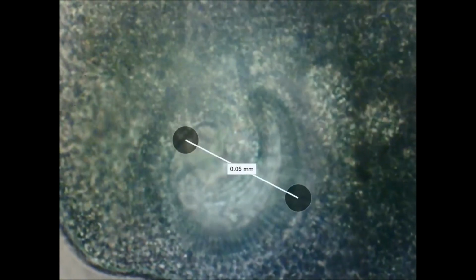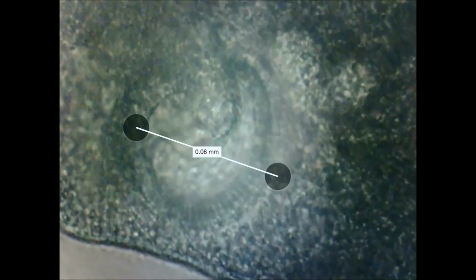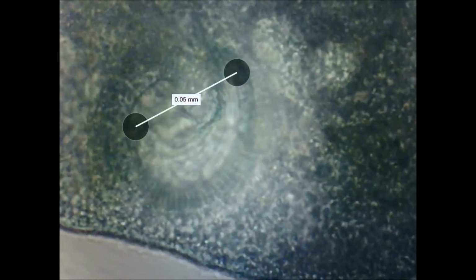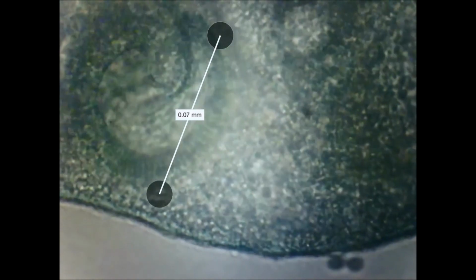But you can see this crescent here comes in at less than 1/10 of a millimeter in size, so it's tiny, and it's basically creating a whirlpool action to get food particles in where a vacuole can form at the bottom of it there on the left side. So that gives you a good feel of how these things feed, and because the buccal funnel is so small, it's feeding almost all the time.